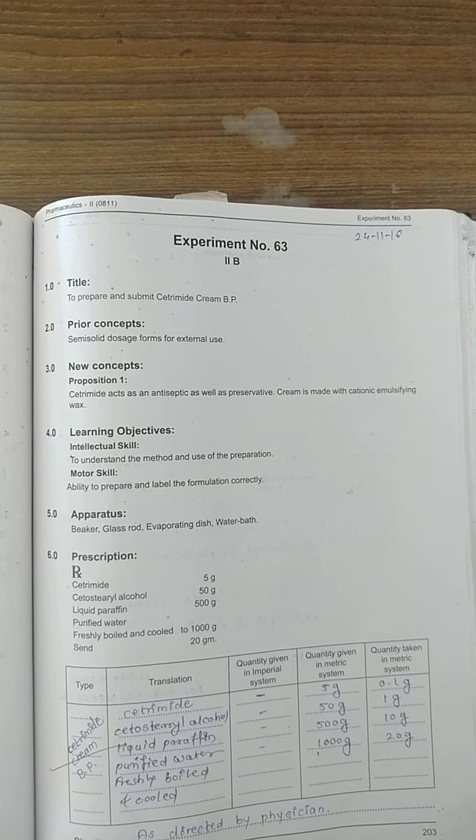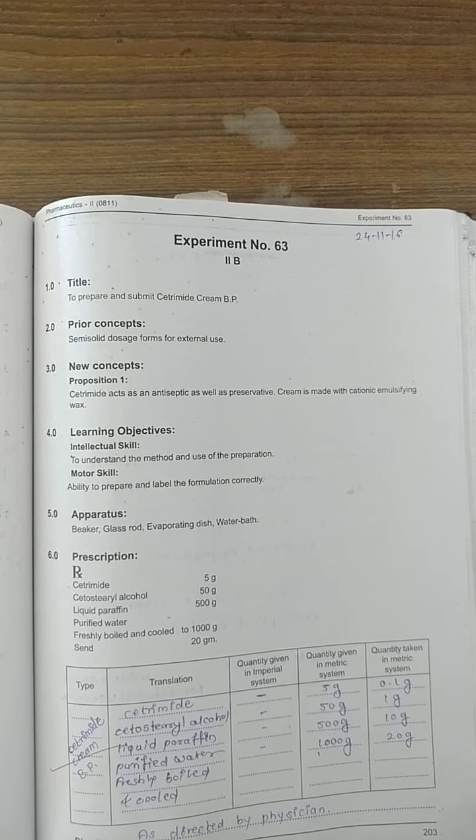A very good morning to all of you. Today we are going to start our experiment number 63. In experiment number 63, we have to prepare and submit cetrimide cream as per British Pharmacopoeia.